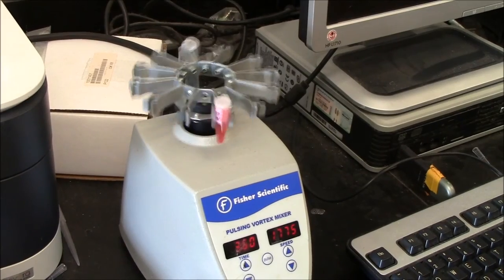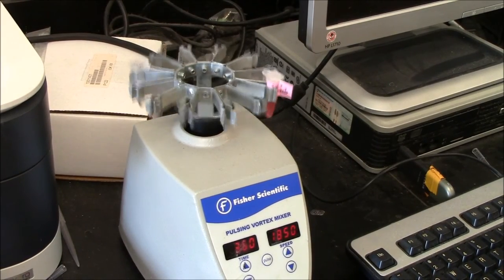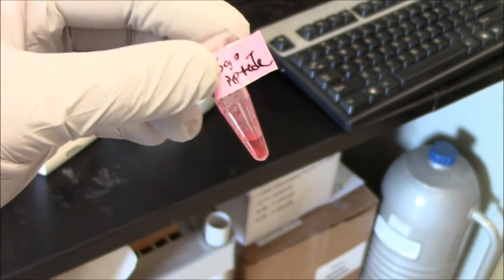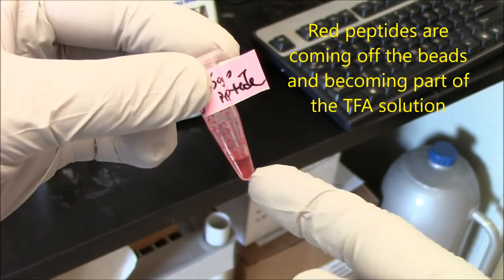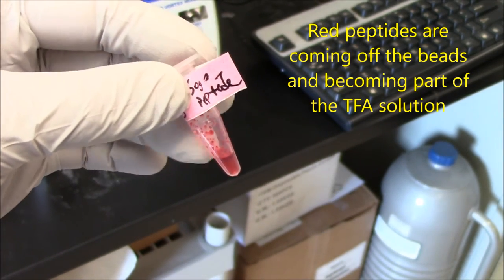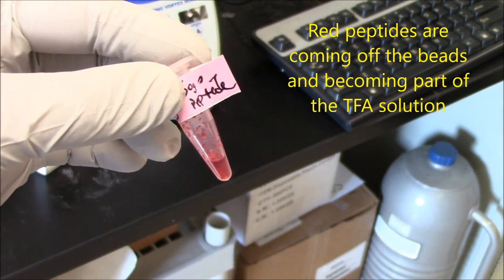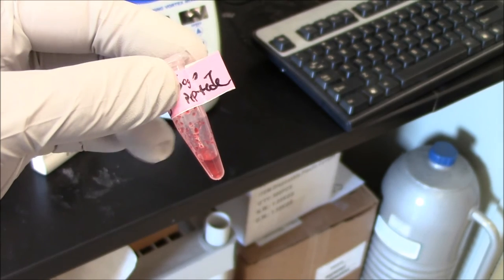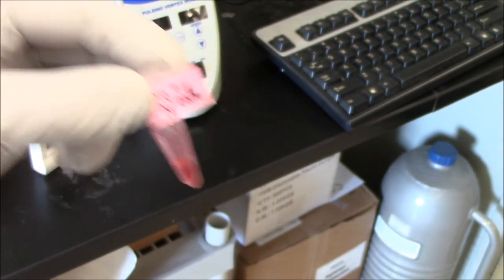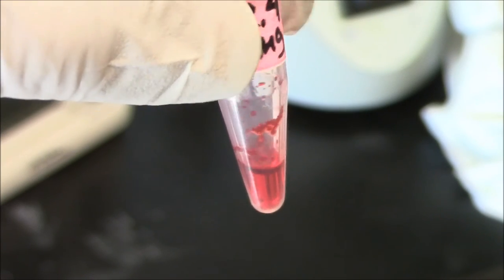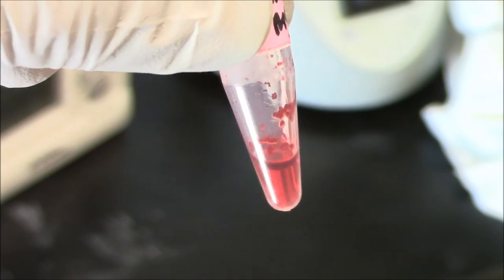Here I've got the beads in TFA on the vortexer. TFA is dense, so the beads tend to float on the top, but there's clearly red color in the TFA solution, therefore I can tell that the peptide is being cleaved from these beads. It's only been about 15 minutes. It's now been about 30 minutes of cleaving from the resin, getting redder in the solution.